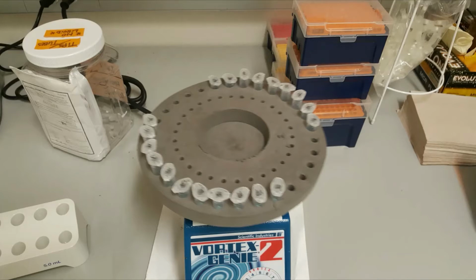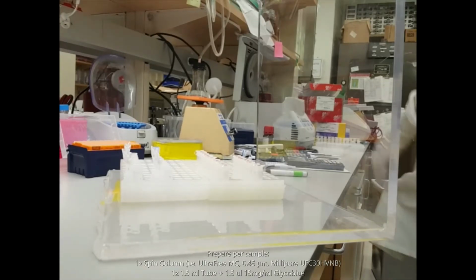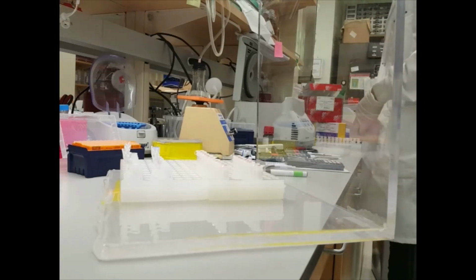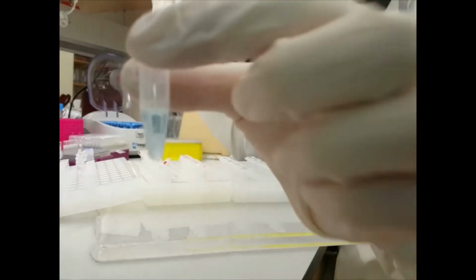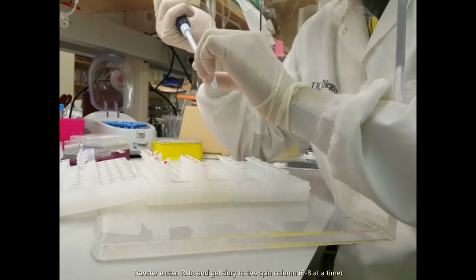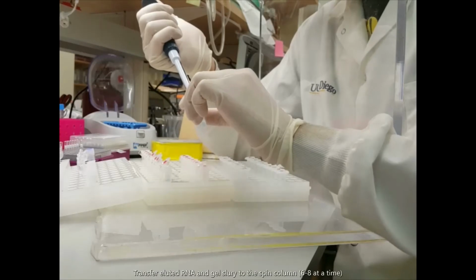While the RNA is eluting, prepare for each sample 1 Millipore Ultrafree spin column and one labeled 1.5 milliliter Eppendorf tube that contains 1.5 microliters of 15 mg per ml GlycoBlue. After the elution, concentrate the slurry to the bottom of the tube by spinning it at 500 g for 20 seconds. Transfer the slurry into the spin columns using a wide bore filter tip.